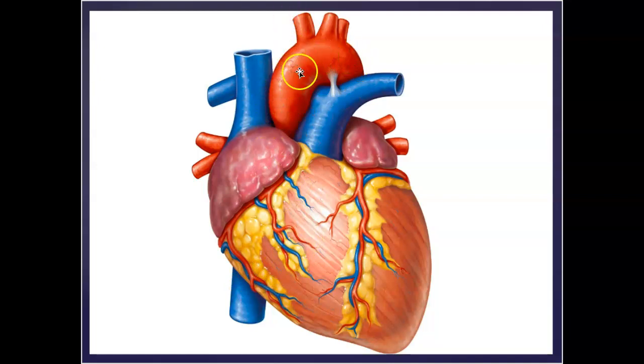We'll learn all these vessels later on, when we talk about the head and the neck. But if we can cut right through here, cutting the aorta before the arch. And then next you're going to cut the pulmonary trunk. As it leaves the right ventricle, blood will pump through the pulmonary trunk. So you can cut that again before the split of the pulmonary arteries, the left and the right. You can see going underneath the arch of the aorta, behind the superior vena cava, here's that right pulmonary artery. So we're going to cut this pulmonary trunk before those.